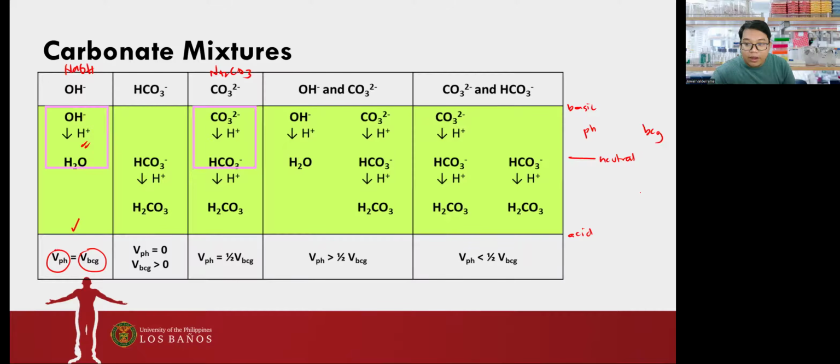Okay? So, when we go back to sodium carbonate, magkakaroon tayo ng intense pink color to faint pink color when all carbonate ions are converted to its bicarbonate component. Ayan. So dyan natitigil yung ating titration using phenolphthalein as indicator. So we will record that as VPH.